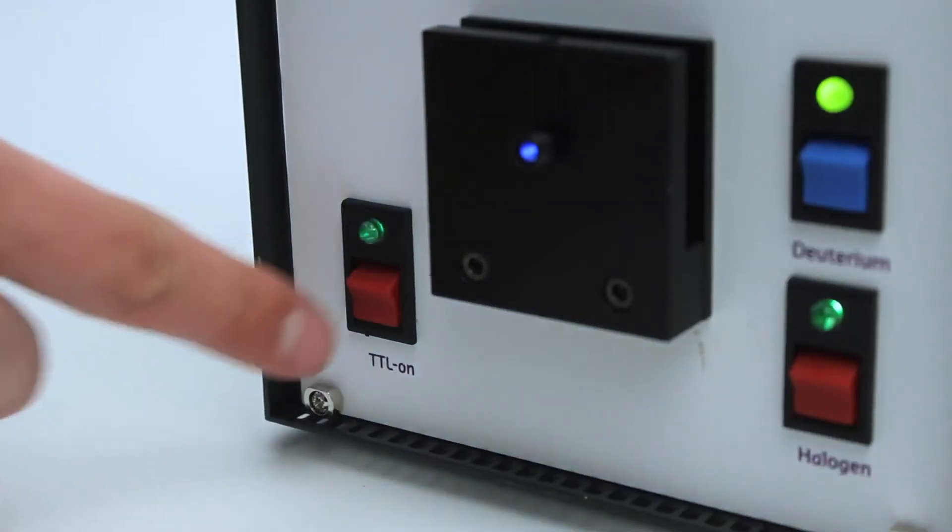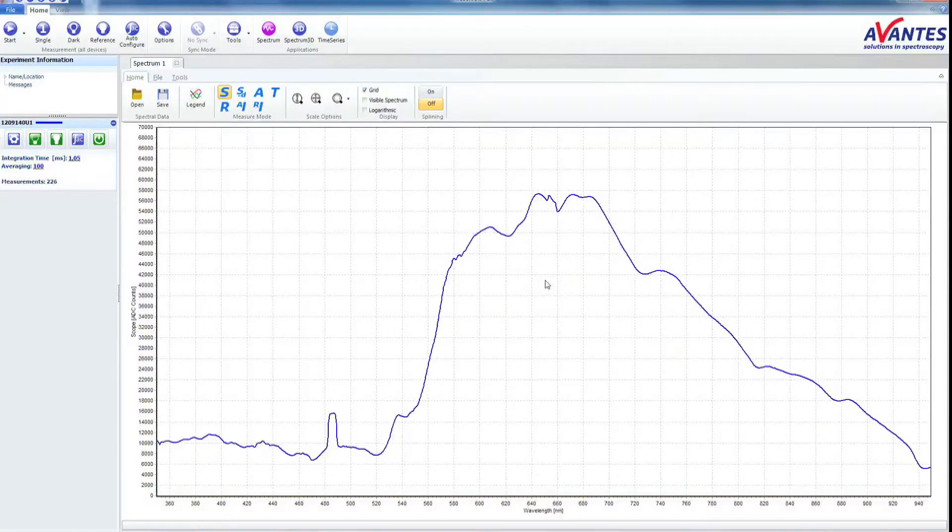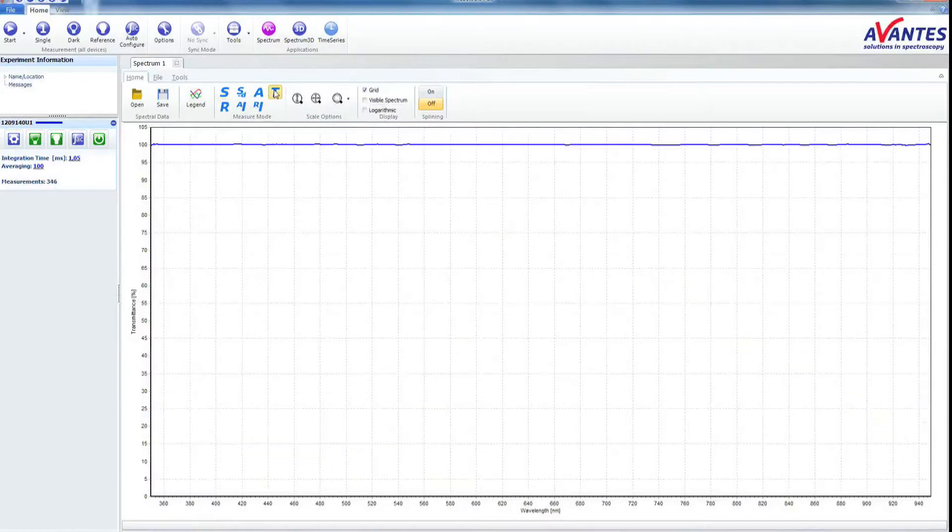Switch on the light source. To measure in transmission mode, please click the button labeled T. Transmissions will always be 100% without any filters or samples in the cuvette holder.